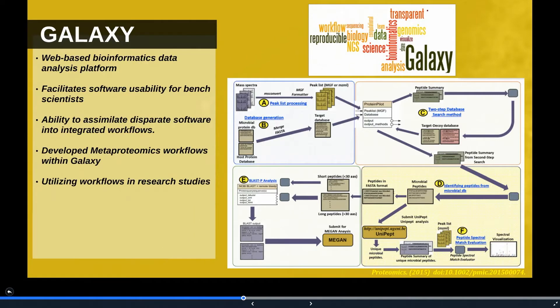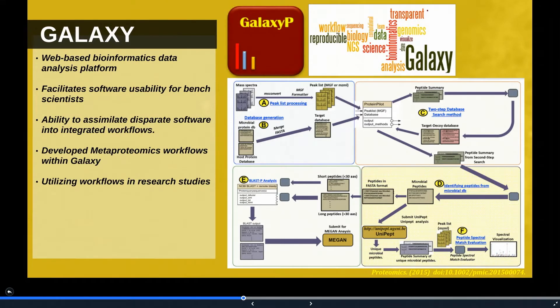Galaxy is an open-source bioinformatics platform which utilizes a web-based interface. Galaxy P, an extension of Galaxy platform for mass spectrometry-based proteomics research, houses the resource required for metaproteomic analysis in a user-friendly interface.